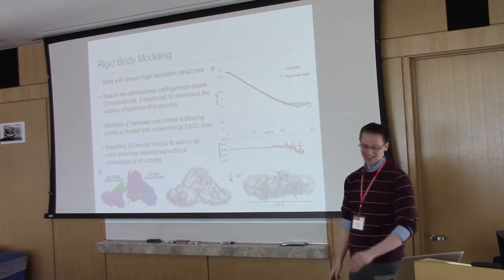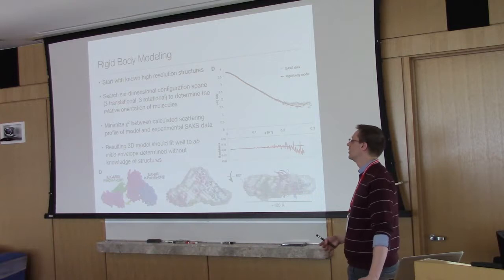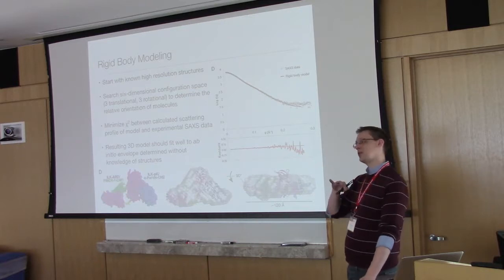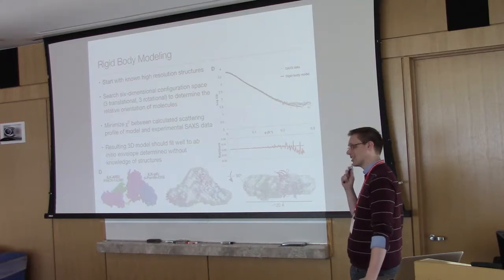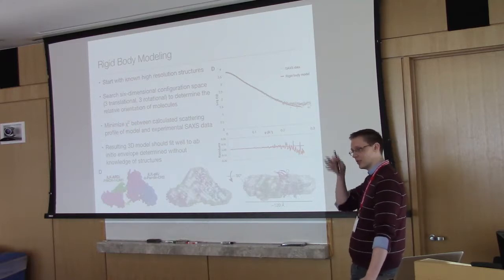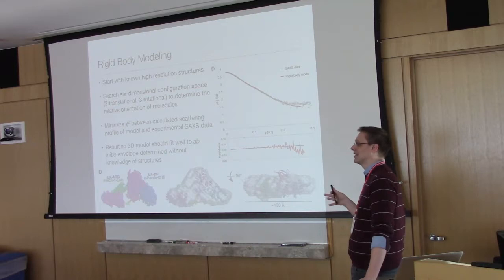The reason I say that is because it's rare that when you collect your data, your errors are accurately calculated. There are some tools now that can help you to sort of translate to better errors. And if your beamline scientists are really, really pedantic, they might be able to get you accurate errors. Chi-squared is fundamentally based on the errors in your data profile being correct. So in these cases, they're really just minimizing chi-squared.